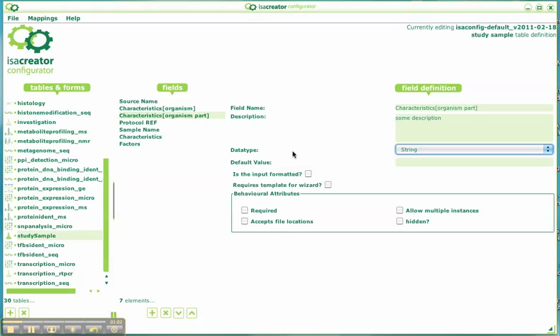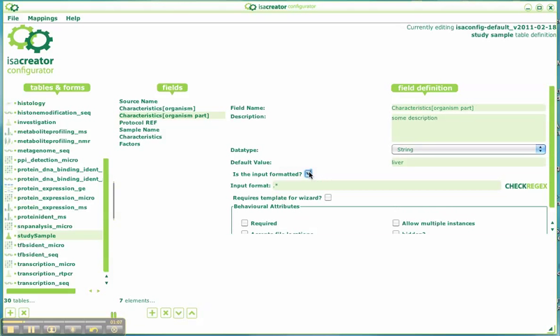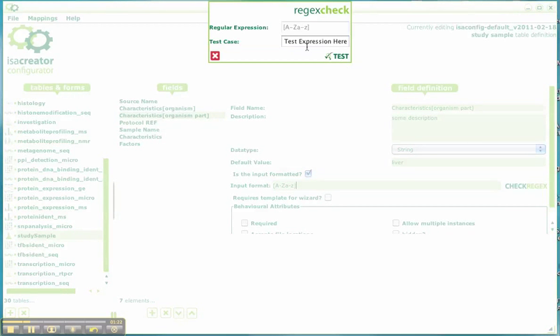The first, with a string, we can have a default value. In that case, we could say liver. We could also ensure that it's only a string that is supplied and there are no numerals in this element. So we can do this and check the regexp. And this will return, of course, failed. Again, failed. But if we say it correctly, then it's fine.